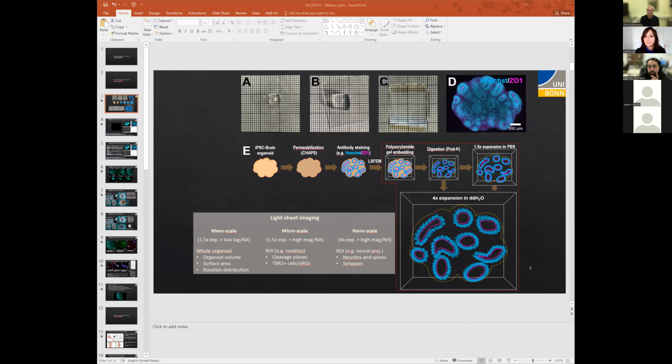Ignacio Velasquez is commenting that the system at Universidad Mayor can detect 2 simultaneous channels and more sequentially with proper alignment.